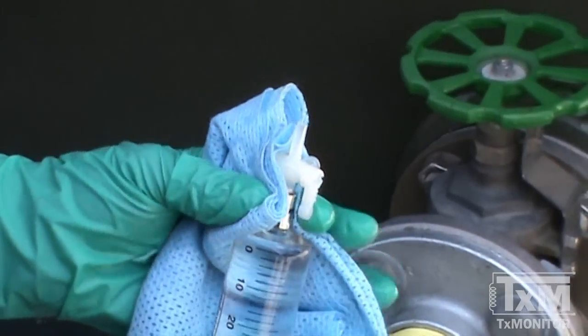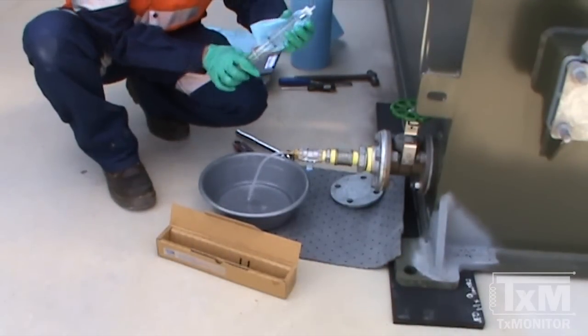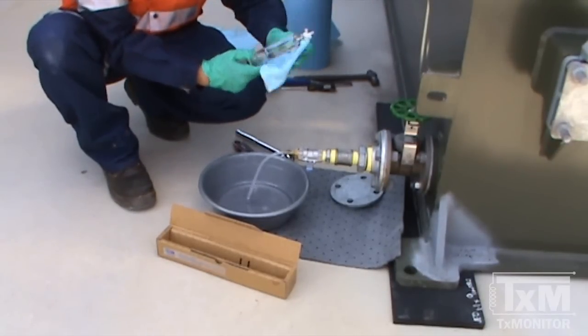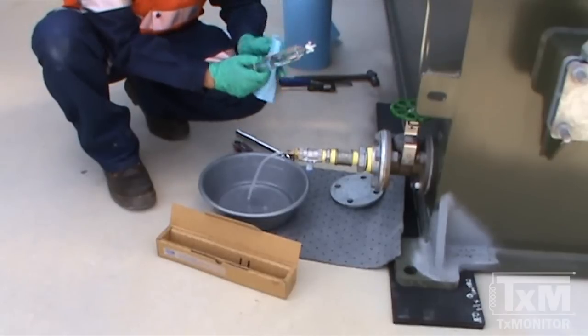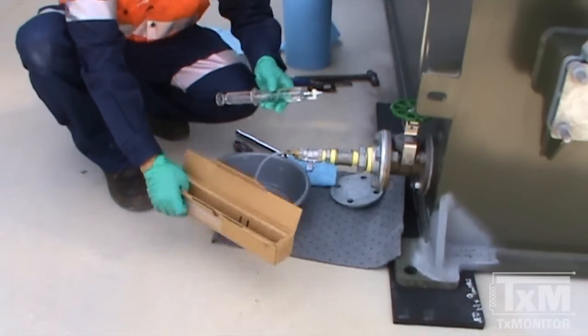Note that any bubbles that form after a prolonged period, i.e. formed during transportation, must not be discarded as they are representative of the sample. Store the syringe in the box provided to protect the sample from sunlight immediately.